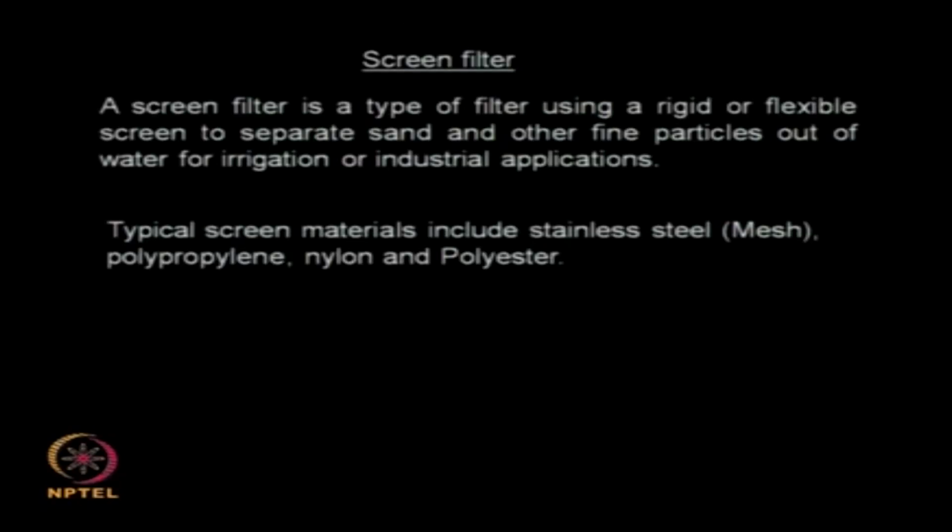Okay, so we have been covering a wide range of subjects relating to solid liquid separations over the past 4 lectures, and I also mentioned that this is mostly the first step after the fermentation or a biotransformation, and here you are removing the solids from a fermentation broth.